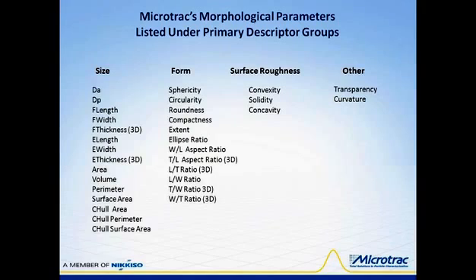First, of course, is size. 15 different size measurements of each particle in various diameters, lengths, widths, thicknesses, and more. The last 3 columns are shapes of various natures and are generally expressed as ratios of size parameters.